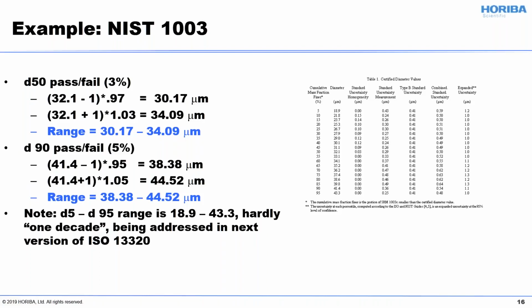If all your particles are the same size, you can take off the bottom, you can take off the top, it doesn't matter, they're all the same size. If there's a range of sizes and there's any segregation, you have to be very careful about how you separate materials.